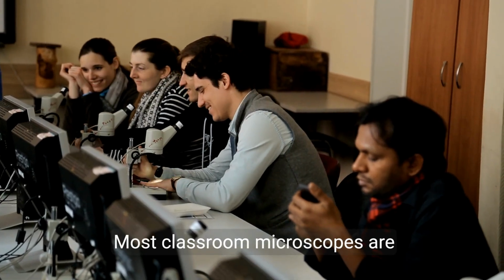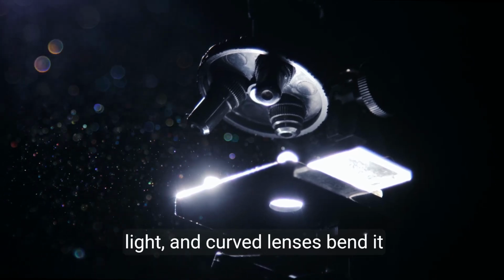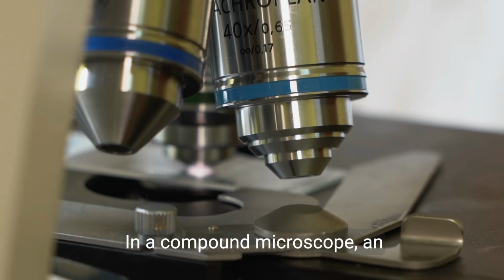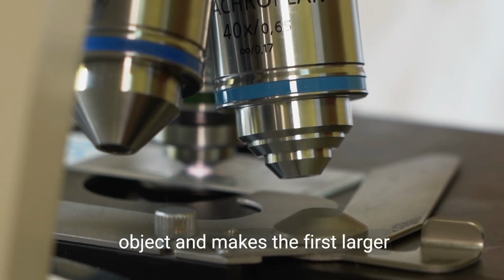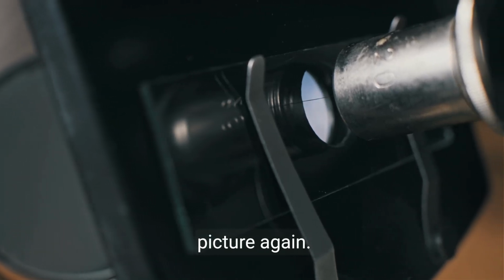Most classroom microscopes are light microscopes. A lamp or mirror provides the light, and curved lenses bend it to form a magnified image. In a compound microscope, an objective lens sits close to the object and makes the first larger picture. The eyepiece enlarges that picture again.